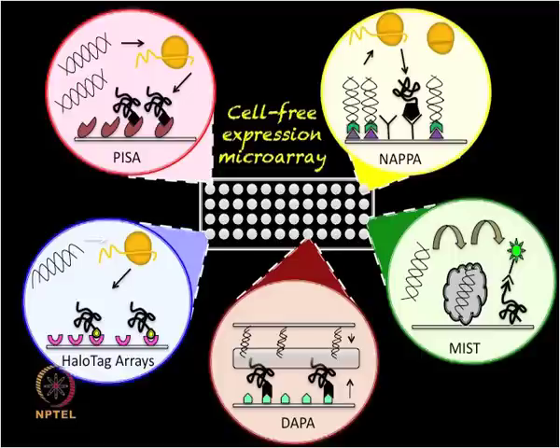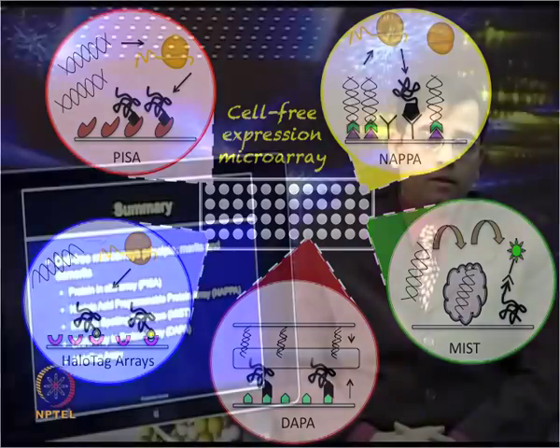These high throughput projects capture data at the scale of an entire organism and provide insight into the biological systems as well as organization of physiological networks. The development of cell-free expression based microarrays has overcome several limitations of cell based protein microarrays and revolutionized the ability to simultaneously study thousands of proteins.